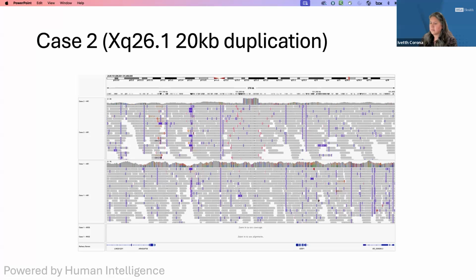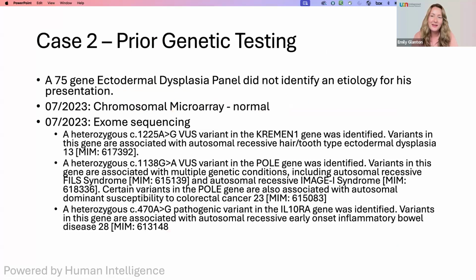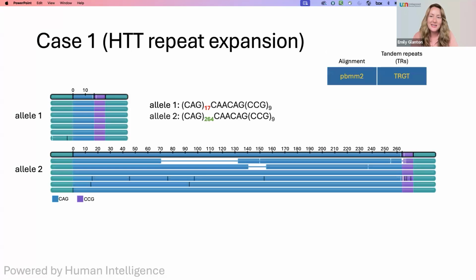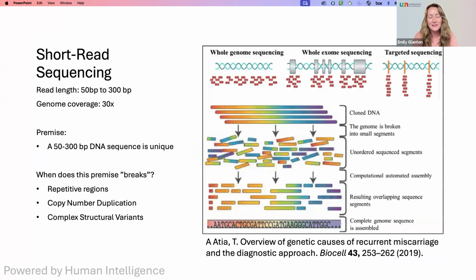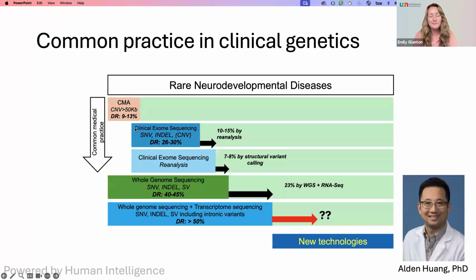Okay. And then, zooming out a little bit about this technology in general: do you foresee this technology one day being a replacement for exome or genome and microarray, or a way to get both types of data in one test? Or do you think that this will continue to be a last stop reserved for the cases that earlier testing is not successful for? So how I see the evolution of that, I think it's similar to this. Exome is still used in the clinic, even though I'm sure genome covers more. So I think that is going to happen.